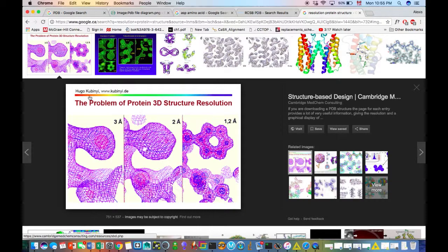But then the precision of your software or your readings or your experiment, actually it's a mix of everything, is going to allow you to get different precision of the estimation of where the amino acid sits, right? Because you get that cloud of electrons. And then you can say, well, something is in here. What is it?